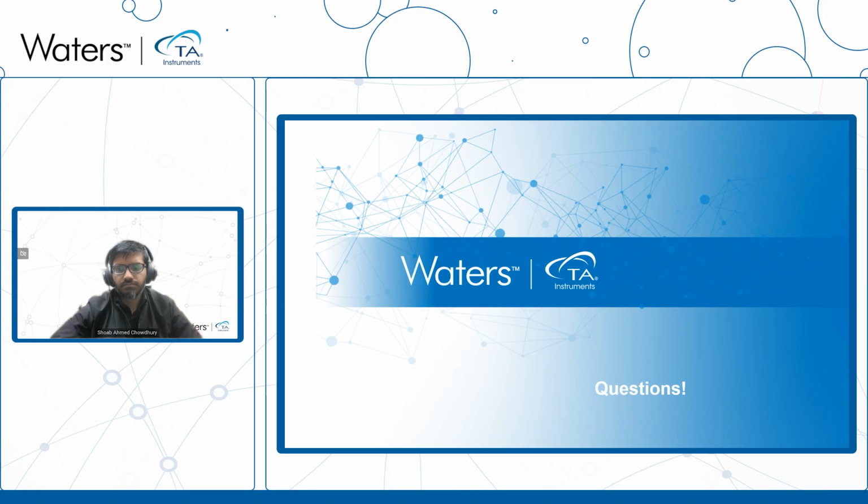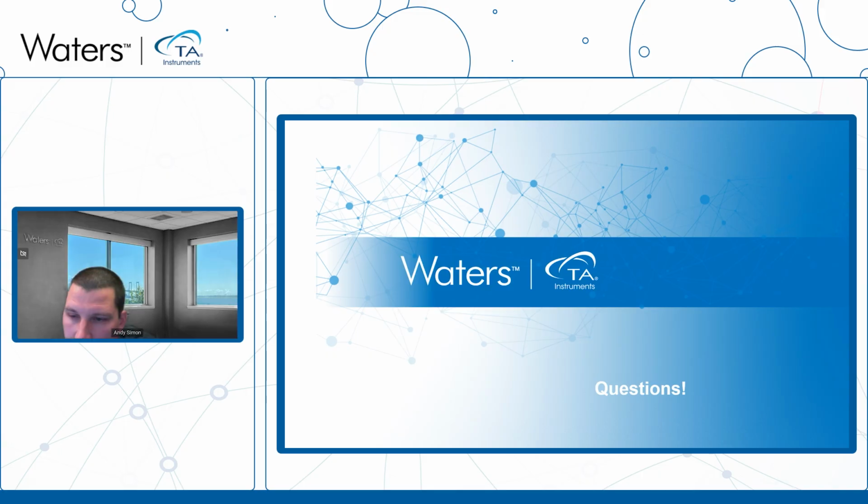Just looking at the few in here still. So this one's on DMA. Can we apply TTS, or time temperature superposition, across temperature ranges for which transitions are occurring, for example, below and above the glass transition temperature?